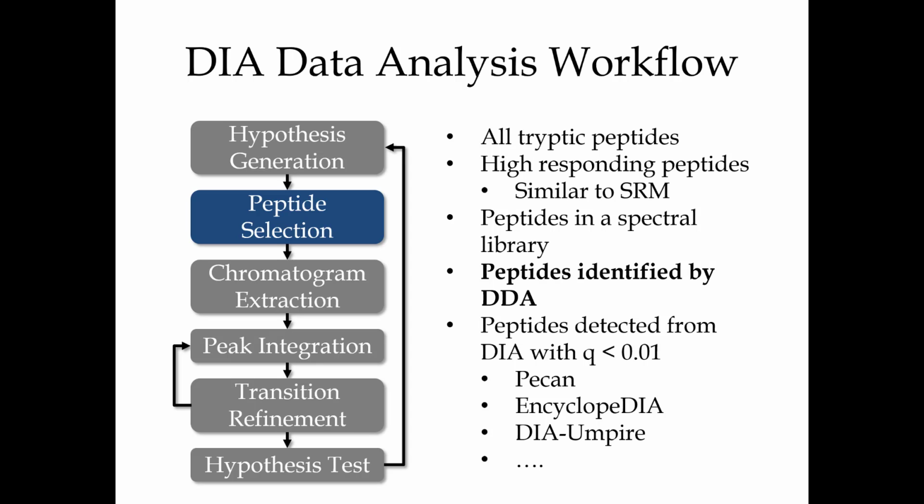I'm going to start with just a little demo of it. It's not great. You'd really like to have DIA with no prior knowledge, and you've never seen it before. Like, who knows whether it's really there.